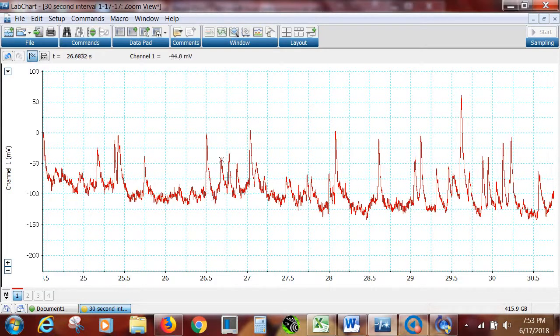Well, 1, 2, 3. That's really on the other side. So let's do 27 to 3. And then 27 to 27.5. 1, 2. Are we going to count this? Did we count that before? That rise? That's pretty good rise, isn't it? That's bigger than the little thing we did over there, I think. So let's do 1, 2, 3. See how it's a little bit off? It's the judgment call. Makes it a little hard.